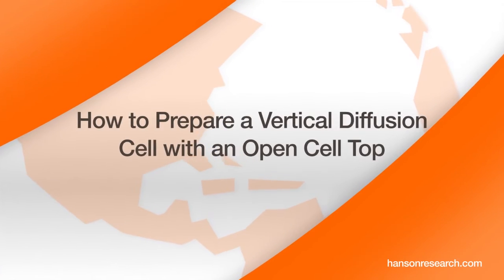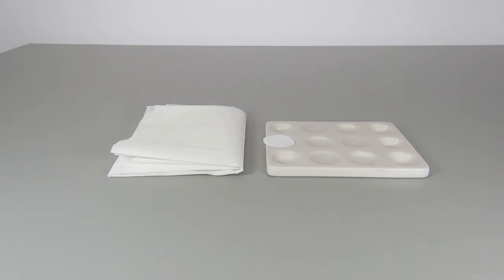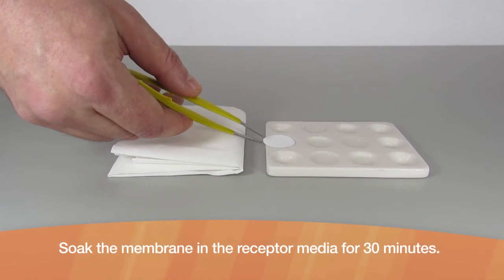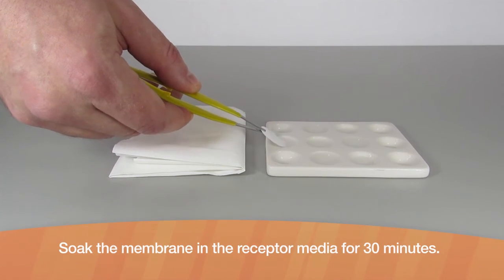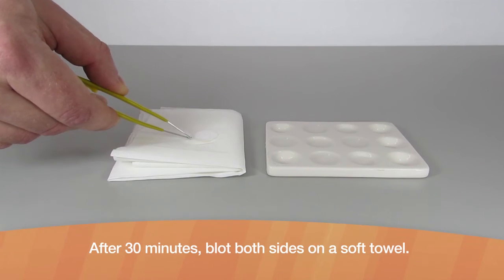How to prepare a vertical diffusion cell with an open cell top. Soak the membrane in the receptor media for 30 minutes. After 30 minutes, blot both sides on a soft towel.